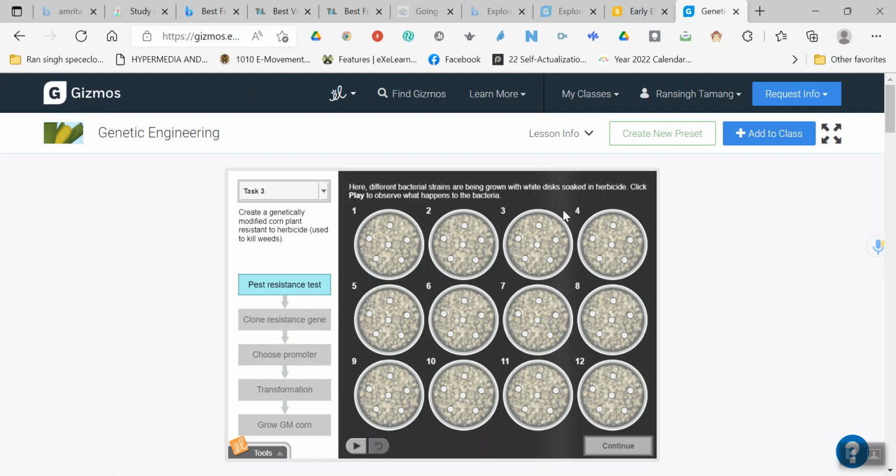They mostly give a trial version for 30 days, so you can explore and then write your experiment, record it, record all the screens, whatever shows the result, and then perform all the experiments online, record it, and bring it into your practical work record book.